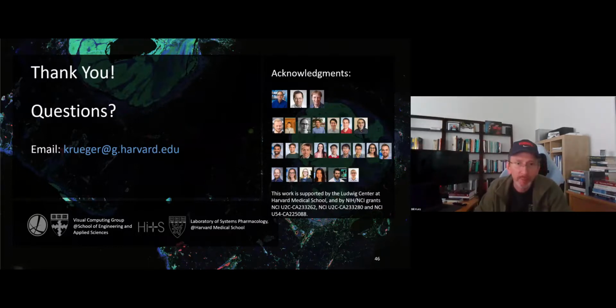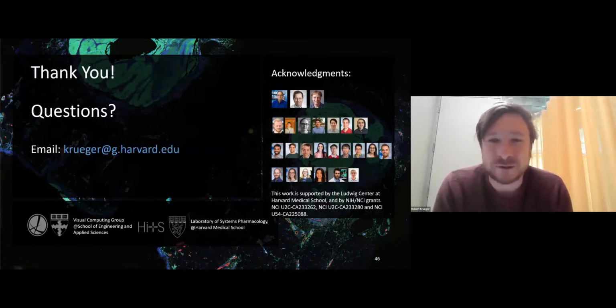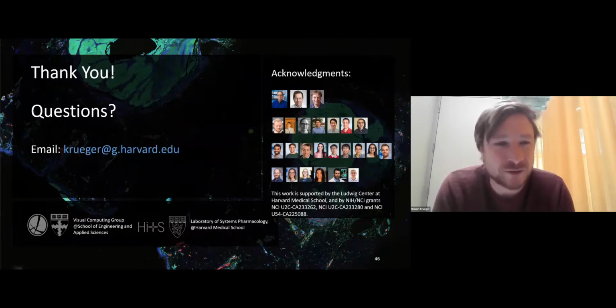Yeah, that's a good question. I think it is. We have core functionality that is the multi-channel rendering, the cell-based segmentation rendering, the linkage to feature data, and the querying of the backend to get the respective tile and feature information. Also parts of the interface and the window management that you see there, and basically we reuse that for all these tools.